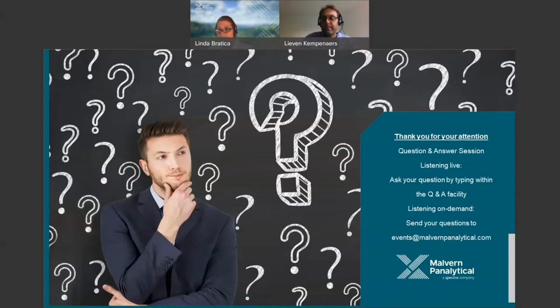Yes, right now we have 5 minutes over time, but so many participants are still joining, so we get your answer right now. Is gain control necessary to perform periodically? Yes.